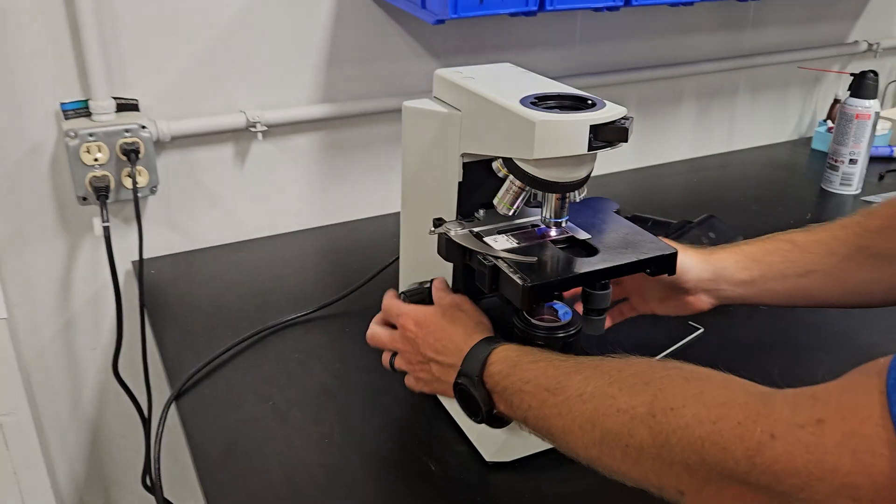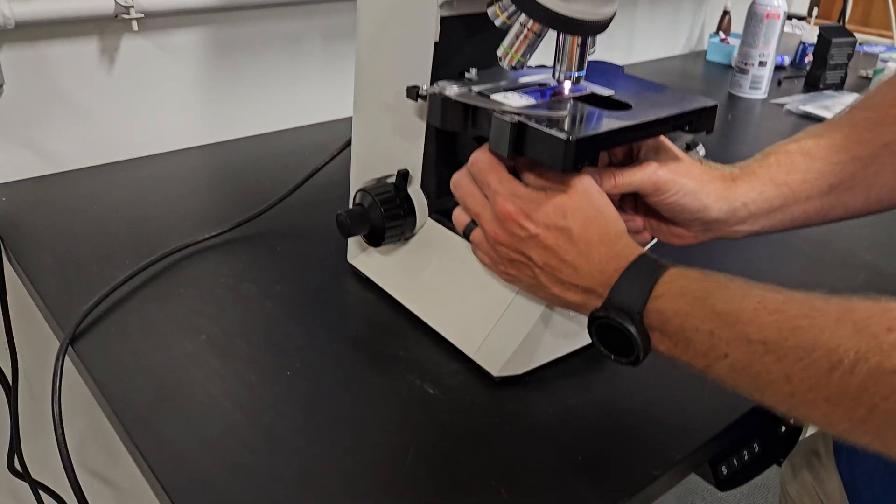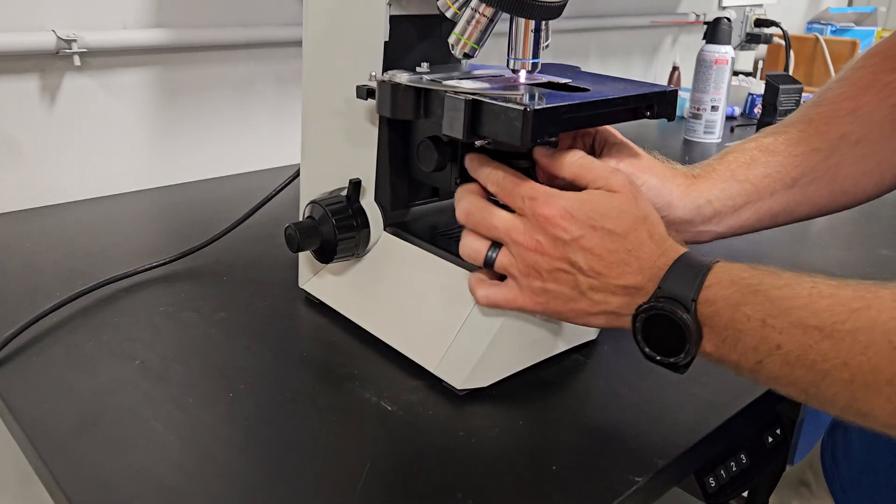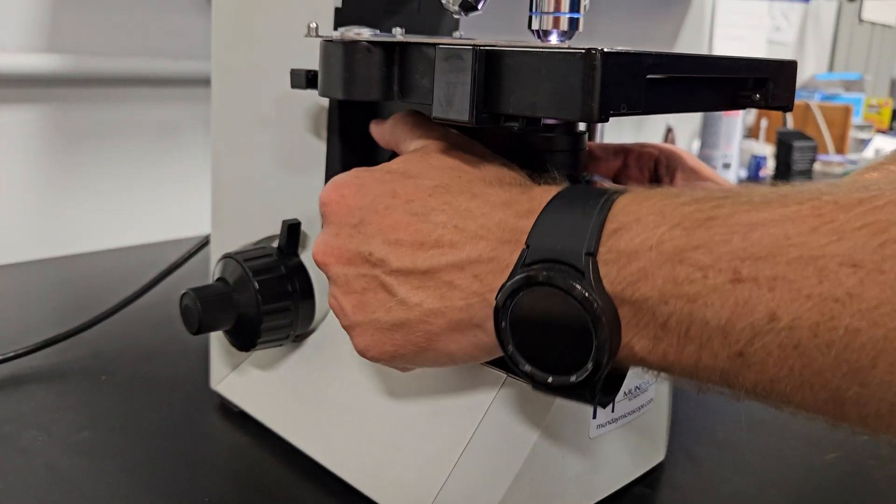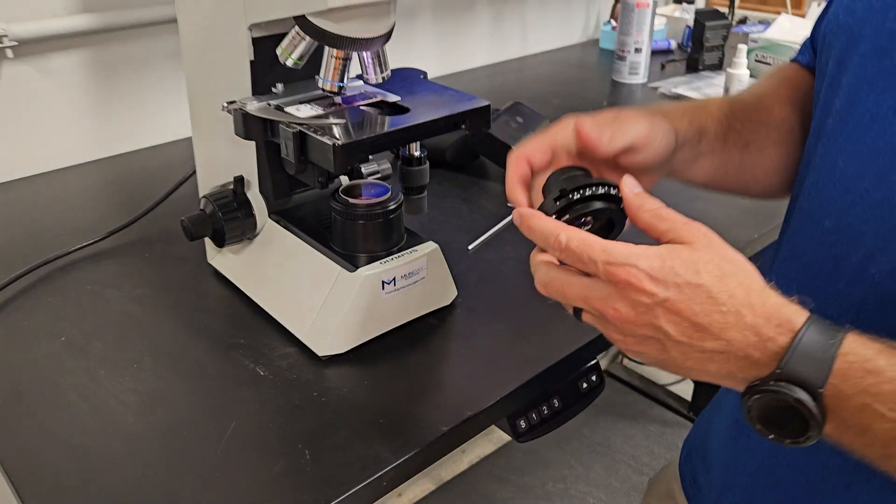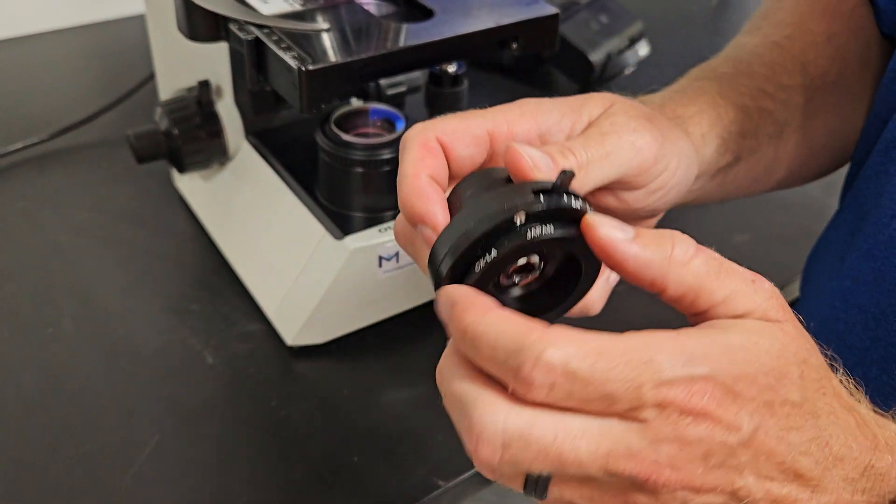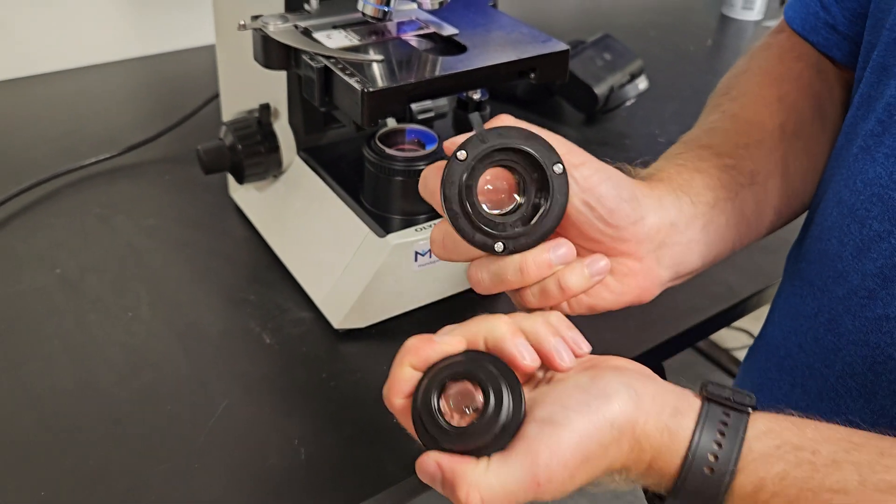We're going to move on with the stage up. We're going to lower the condenser. It's this screw right here that loosens the condenser. Whenever you get a CX, if you want to put a 2x on there, you have to have this lens. CX-LA. It snaps in the bottom.